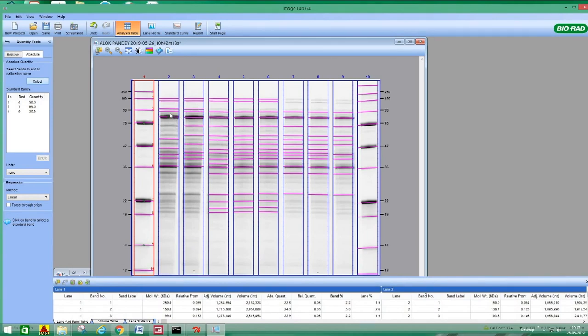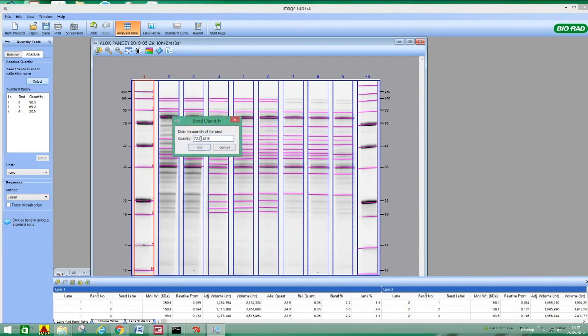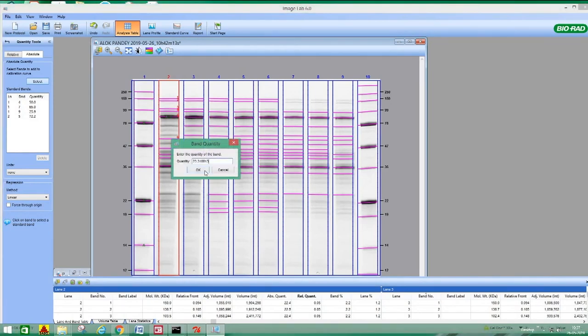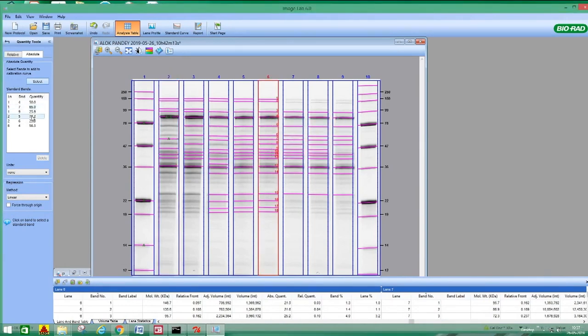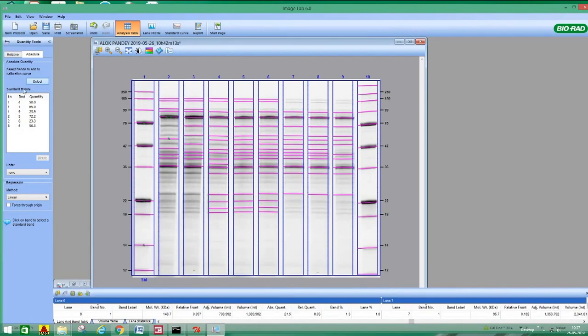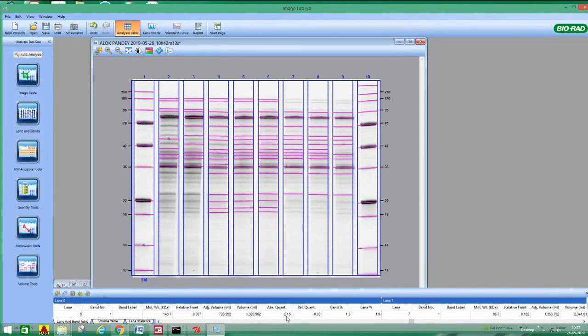So you just take your mouse pointer to any band you want to calculate the actual quantity. You can click on that one, it will give automatically 72.214 nanograms. You want to calculate this band, so you just keep that one, it will give the value. You want to calculate this one, it will give the value. So in this way you can calculate absolute quantity of any given band in the gel. So you can export these results, or you can save from this one also.